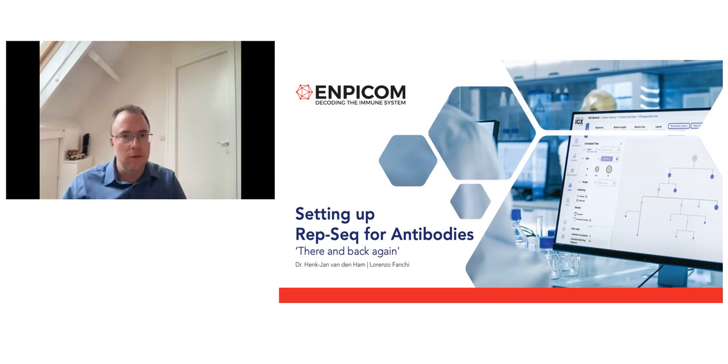Today I'd like to tell you something about the work we've done to set up a repertoire sequencing assay, specifically for antibodies. The assay is applicable more broadly than just antibodies, but that will be the focus for today. In the first part, I'll be talking a little bit about some of the lab and the simulation approaches that we've used. And in the second part, my colleague Lorenzo will take you through a sneak preview of our new processing software.